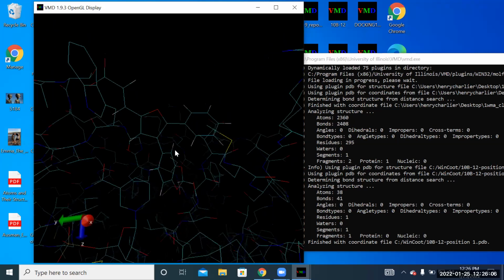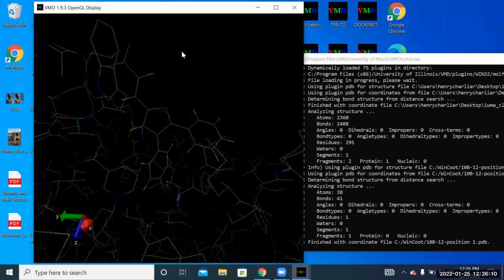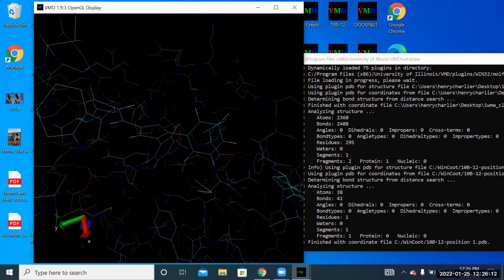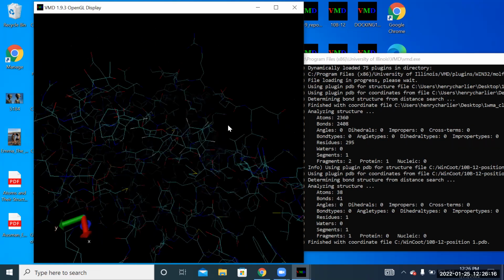Now, one thing I want to mention, and not knowing if you've had biochemistry yet, or if I've told you this yet, but when these types of structures are solved, we use X-ray crystallography a lot of times.